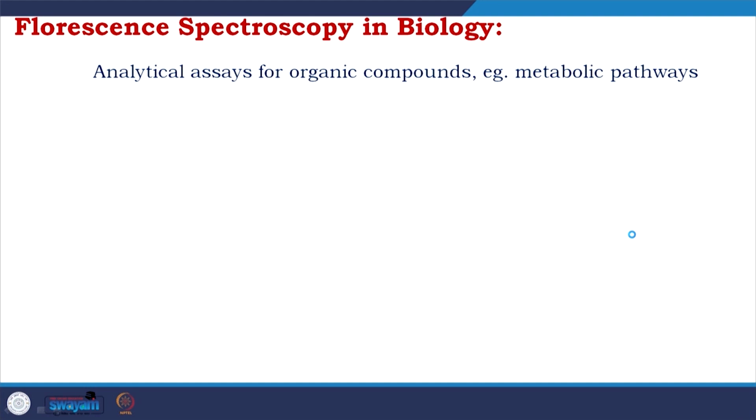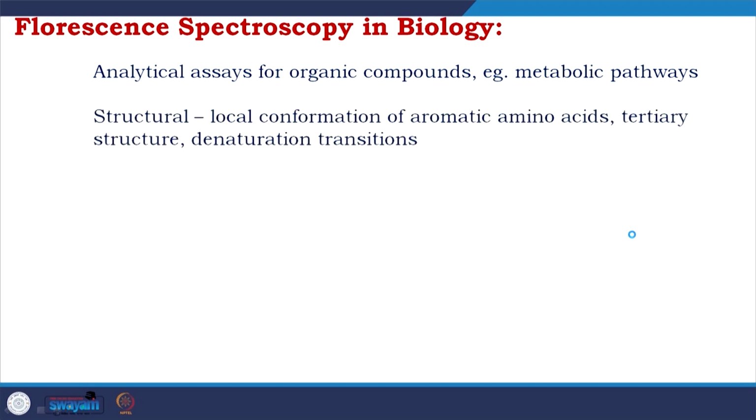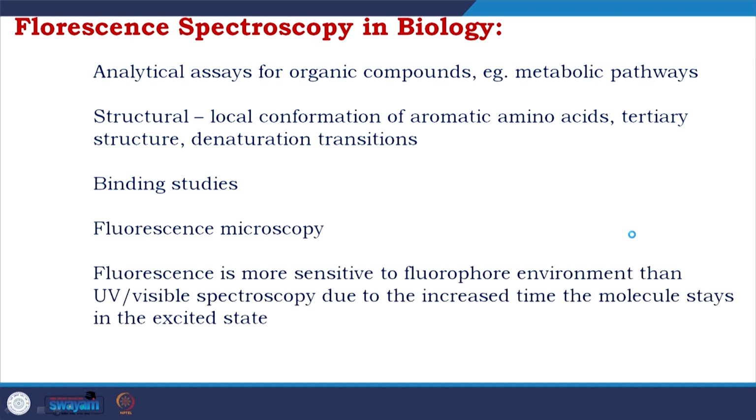Fluorescence spectroscopy in biology: analytical assays for organic compounds to get the metabolic pathways, structural local conformation of aromatic amino acids, tertiary structure, denaturation transitions, binding studies. Fluorescence microscopy is very popular. Fluorescence is more sensitive to fluorophore environment than UV-visible spectroscopy due to the increased time the molecule stays in the excited state.